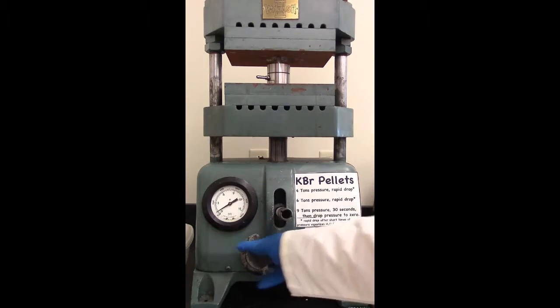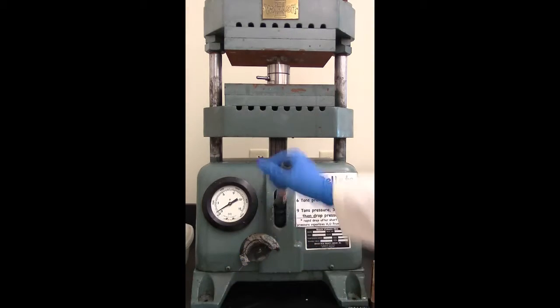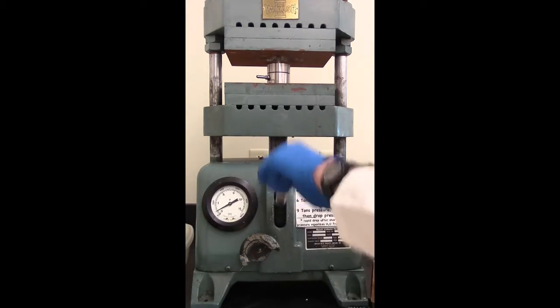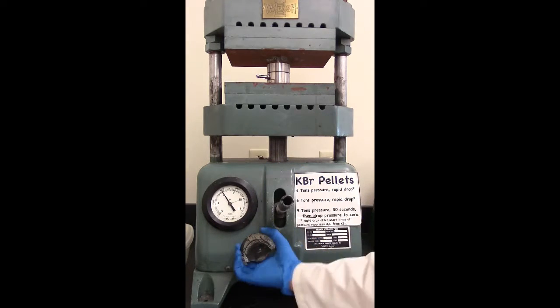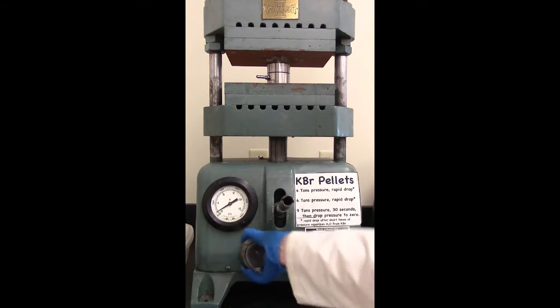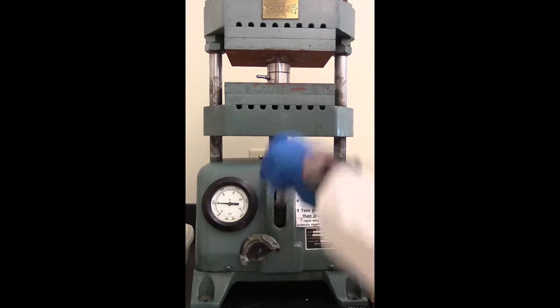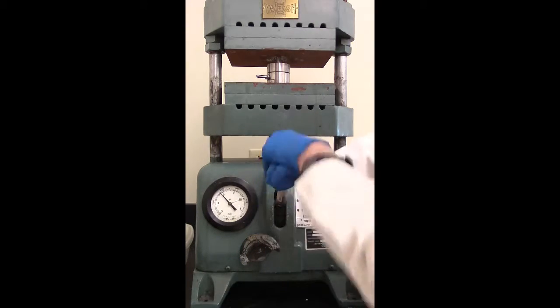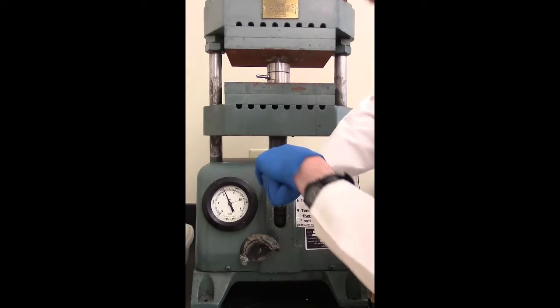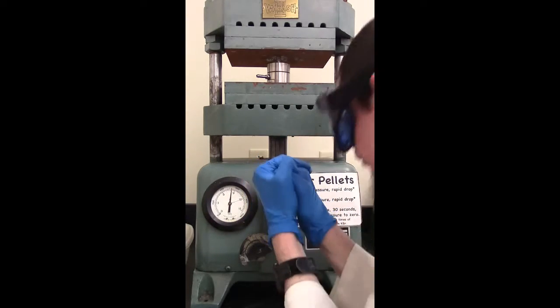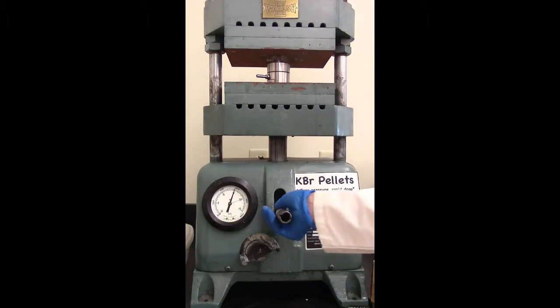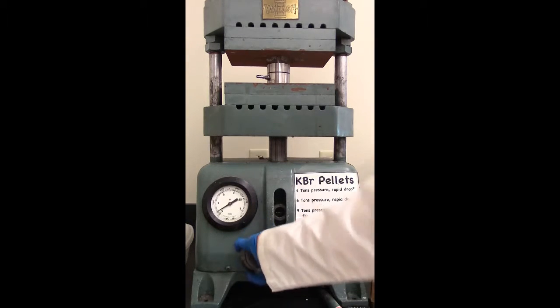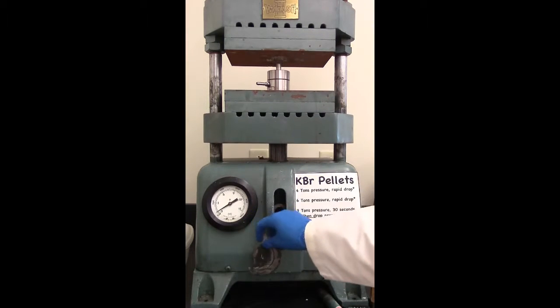In order to drop it, we just turn this knob here. And that'll drop this whole assembly down. Okay, get four tons of pressure, drop. Now to six tons of pressure. Rapid drop to zero. Now to nine tons. Wait for 30 seconds. All right, it's been about 30 seconds. Now we are ready to relieve the pressure and drop this down a bit.